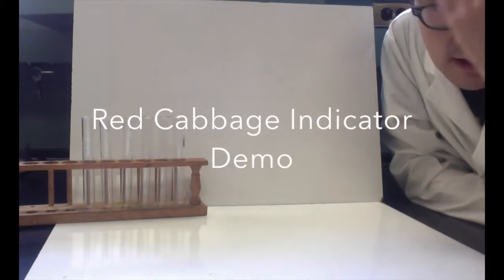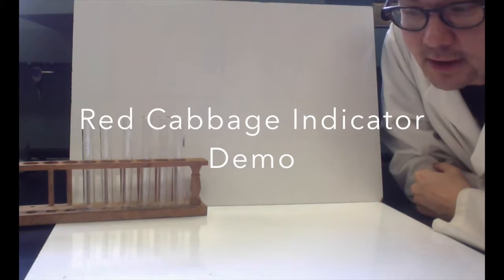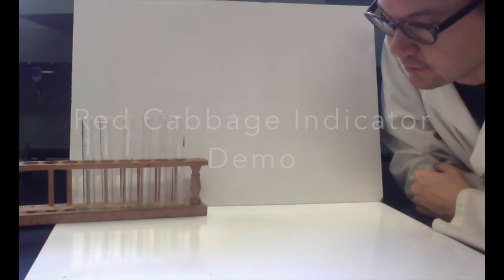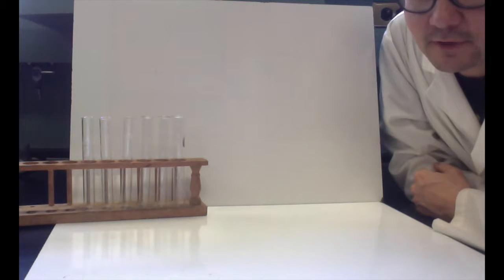Hello, this is Mr. Sasaki, and I'm going to do a demonstration of some acid and base chemistry with an indicator that is a purple or blue grape-colored substance made out of red cabbage.